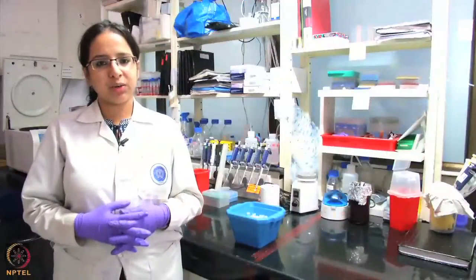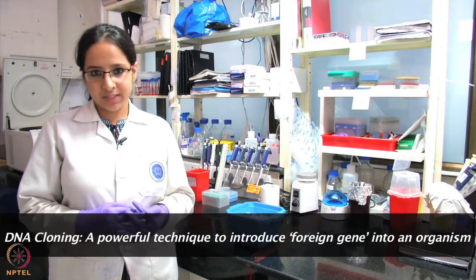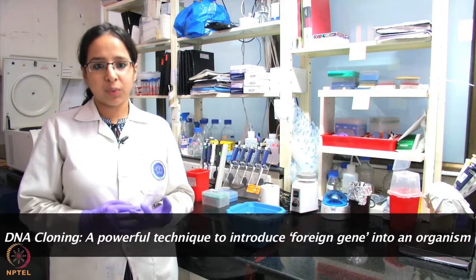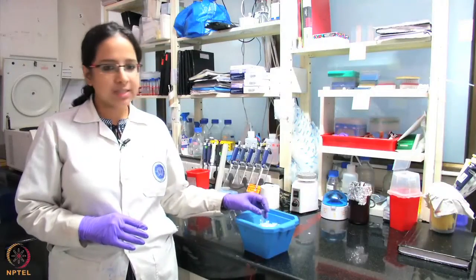Hello everybody. Today we are going to discuss the workflow of molecular cloning. Molecular cloning has some basic steps which we are going to go through one by one. Firstly, what we are trying to do is introduce a foreign gene into an organism, which we normally refer to as insert. So this is my insert sample.